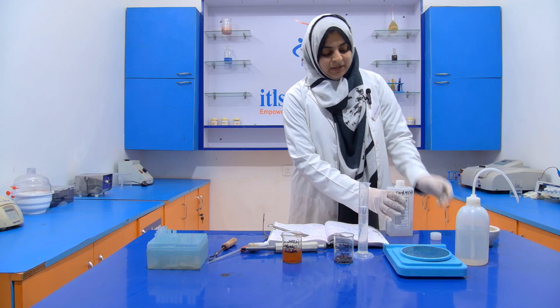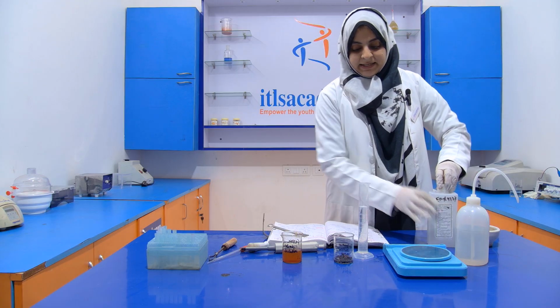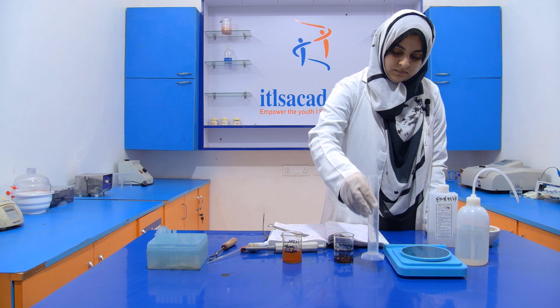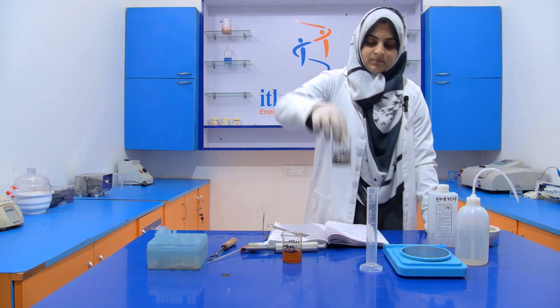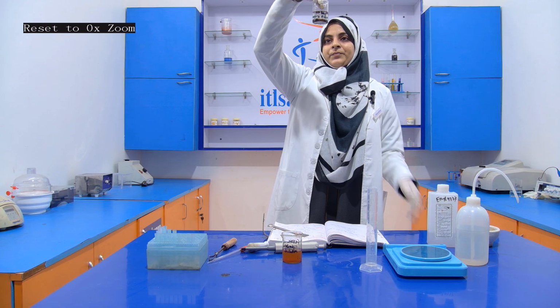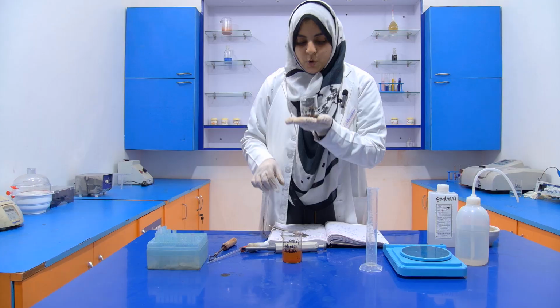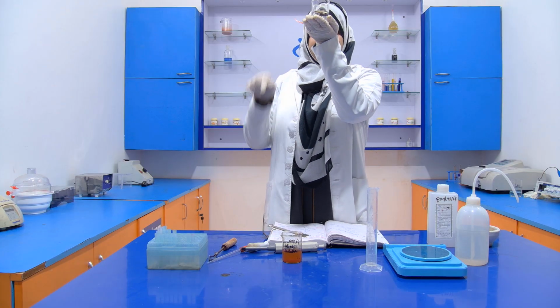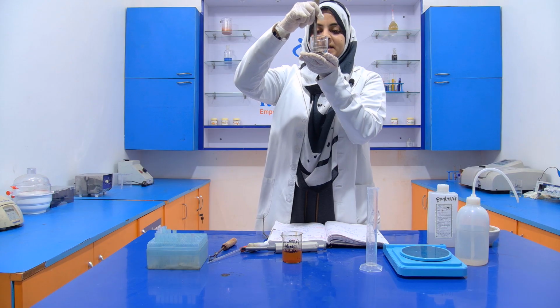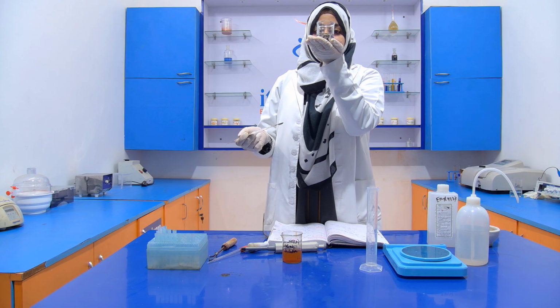If the mature black pepper is like these, then it will sink. You can see that all the black pepper sinks, but only a few. Now I am mixing it properly, then we will see again. If it does not sink, then it means that it is adulterant.